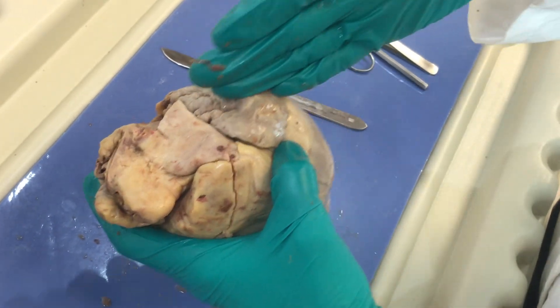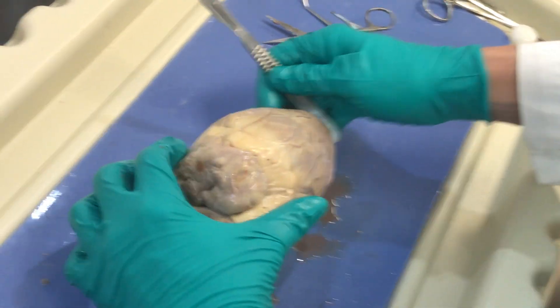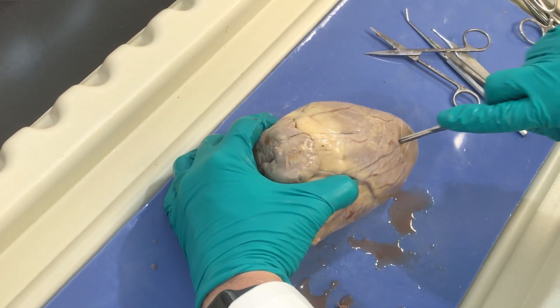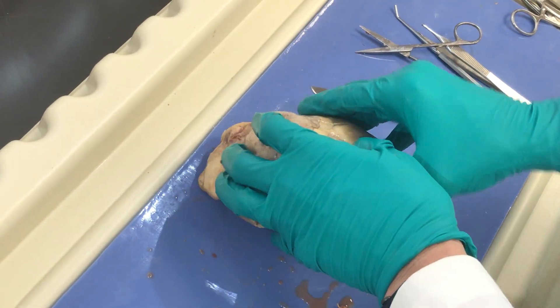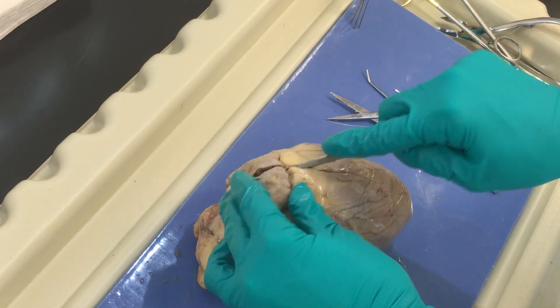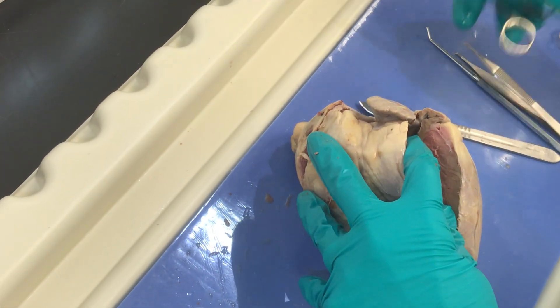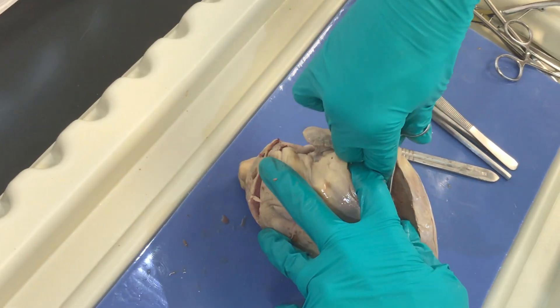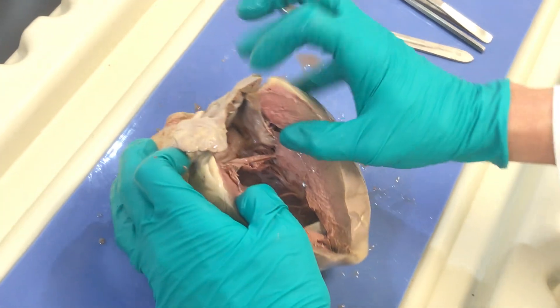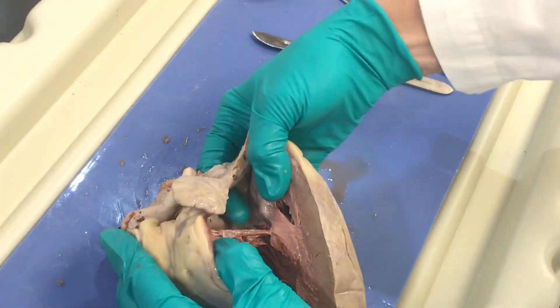Now I'm going to make an incision down from the left auricle down into the left ventricle. When you do this, again you want to be careful that you are anchoring your heart and cutting down in here. Remember the left ventricle is much thicker than the right ventricle, so I might have to extend this cut a little bit more. Wow, you can really see the difference in the size of this ventricular free wall — it is much bigger than the right side.